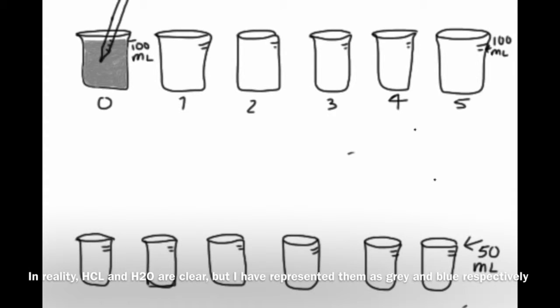Pipette 10 milliliters of hydrogen chloride into beaker 1. Now add 90 milliliters of water to beaker 1 to make 100 milliliters. Pipette 10 milliliters of 0.10 molarity hydrogen chloride from beaker 1 into beaker 2. Now add 90 milliliters of water to beaker 2 to make 100 milliliters of 0.010 molarity hydrogen chloride.